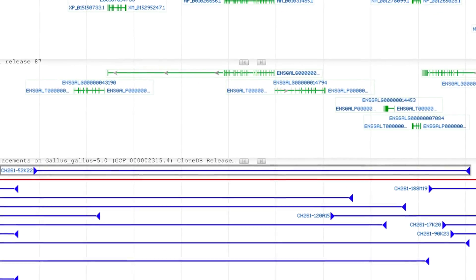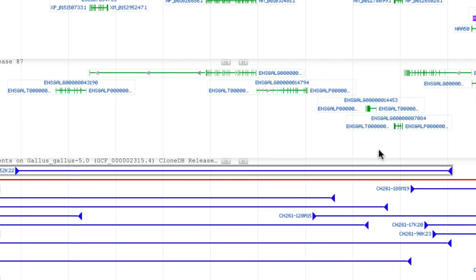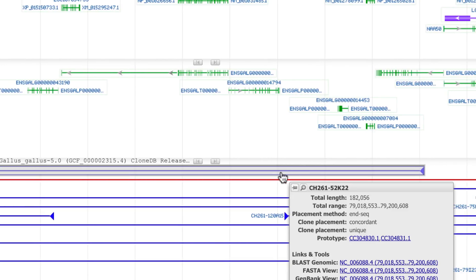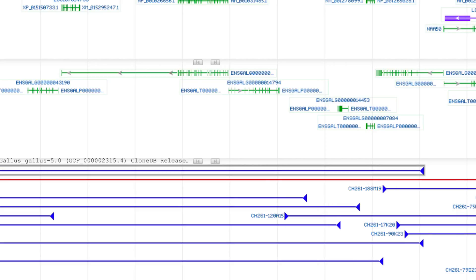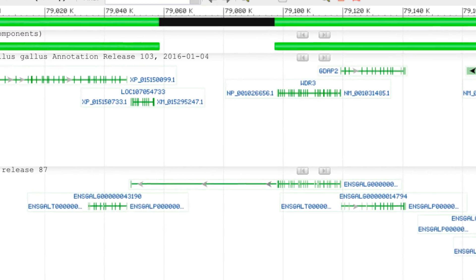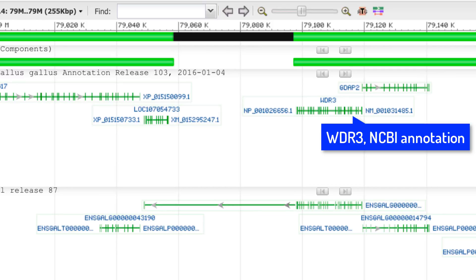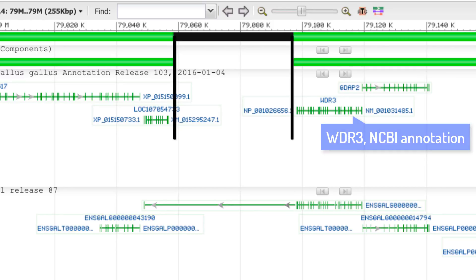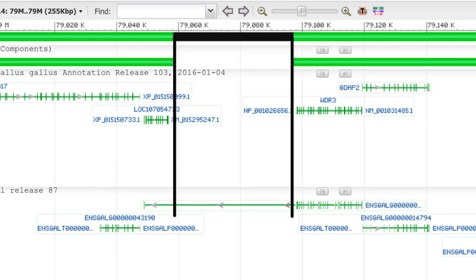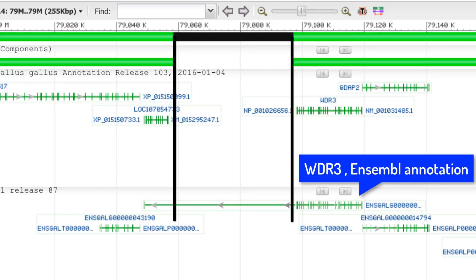Blue clones are concordant, red clones are discordant. Hovering the mouse over any individual clone placement opens a tooltip that provides additional detail. We see that the WDR3 gene is just at the edge of a gap according to NCBI annotation, and is interrupted by this gap according to the Ensembl annotation.